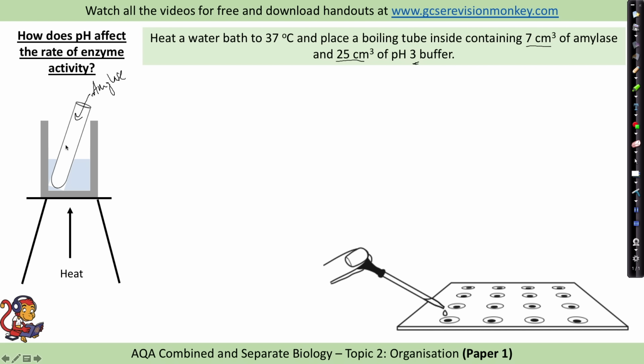So in this test tube we've got amylase going in there and also a pH buffer which will all mix together. Now a pH buffer is just a solution which has an exact pH. In this case we're starting at pH 3, so something that your science technicians could make up for you. Now we want to heat that up to 37 degrees or thereabouts. In your exam they might talk about 35 or 40, but around that kind of temperature, because this is body temperature and that is the optimum temperature for enzymes.